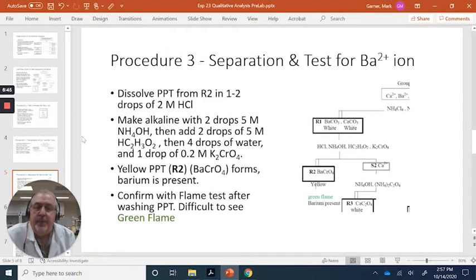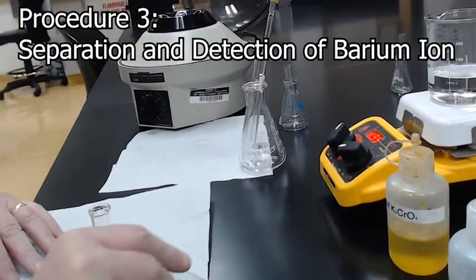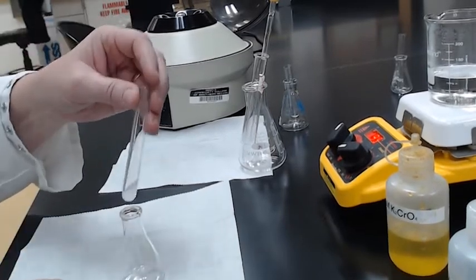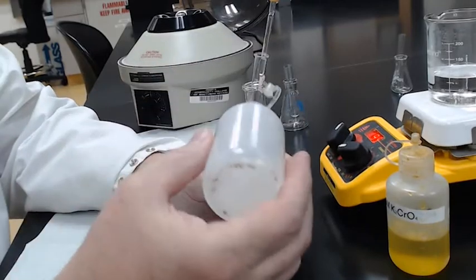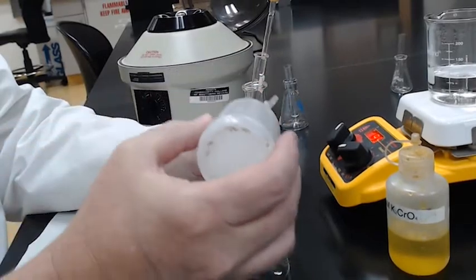To further confirm whether or not barium is present, we're going to need to wash that precipitate and then perform a flame test. If we get a green flame, then we also have a secondary confirm that barium was present in the unknown. We now have our solid, and we're going to test for barium right now, but the first thing we have to do is dissolve it completely with hydrochloric acid, and the trick here is to use the minimum drops possible. Normally it takes 1, 2, or 3, so there's 1 drop, didn't work.